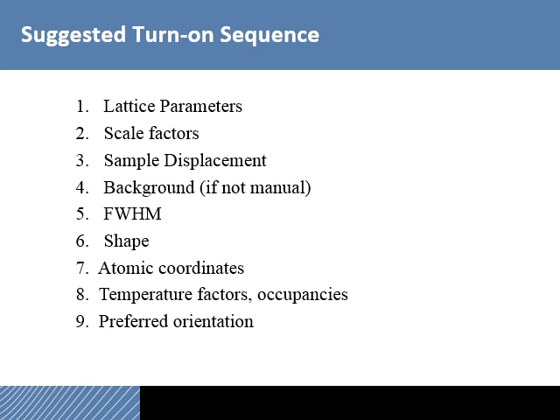What's also important is before you start a Rietveld refinement, you want to manually get your model to be as close to the existing pattern as possible. Again, this is to avoid a false minimum.